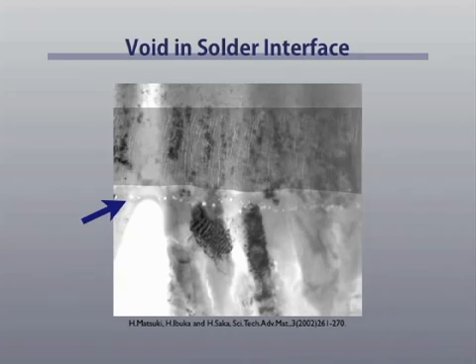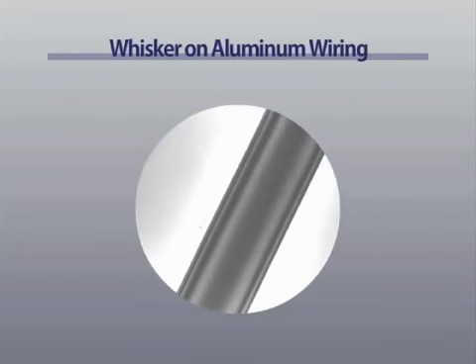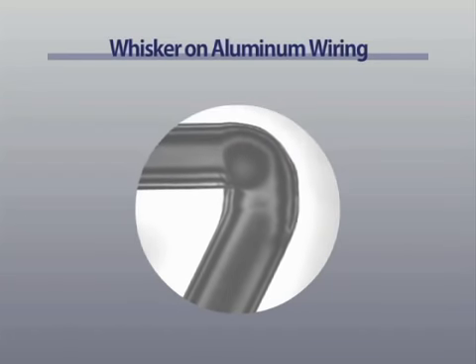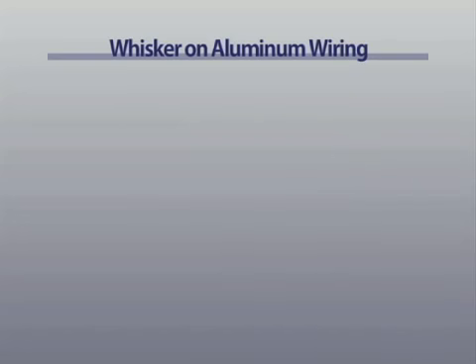Nowadays, people cannot stay without cell phones. Have you ever imagined that without solder joints, these devices would be of no use at all? Wiring in a device can be compared to a highway. This highway, in the nano world, exhibits various surprising phenomena, one of which is formation of whiskers. Whiskers give rise to a short circuit, leading to the breakdown of the device.